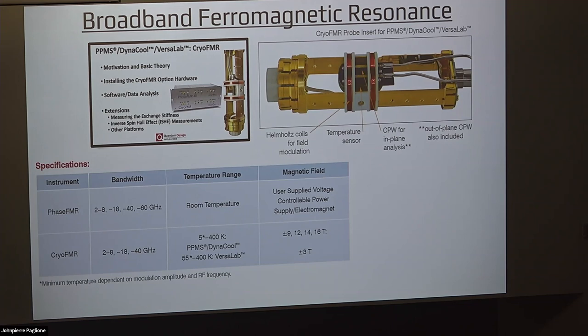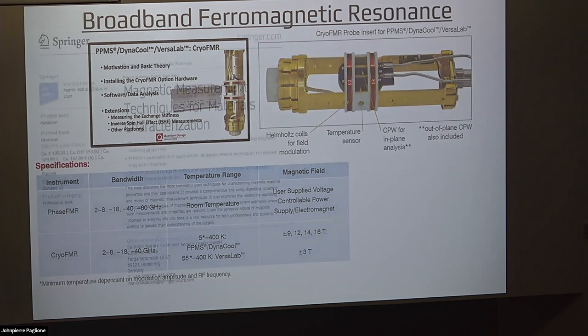But there you do have to be careful. You don't want to juice more than about 500 milliamps in that, because if you burn that coil out, now you're buying a superconducting magnet as well. Burning this one out is a little bit safer. But anyway, best contact your local application scientist who can help you out with these things. This is a complex parameter space one needs to work in.